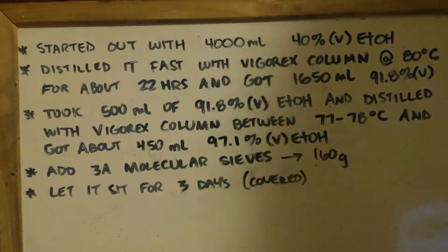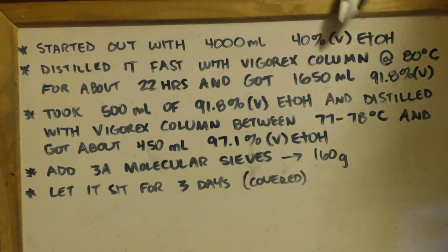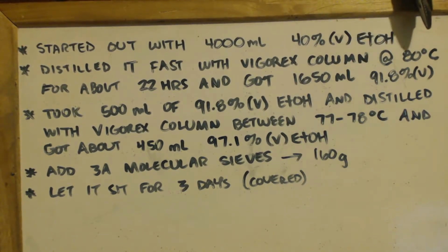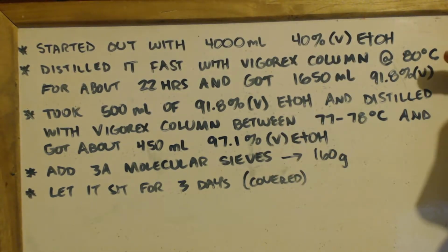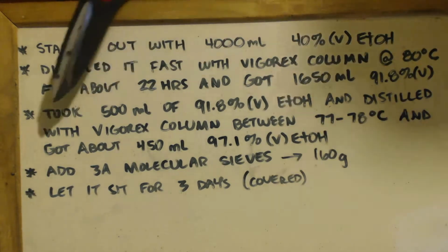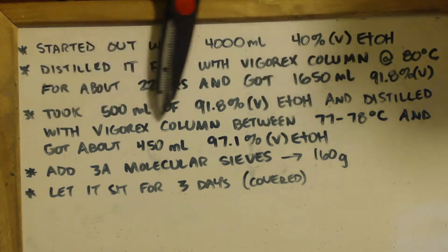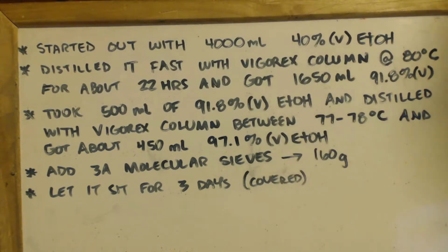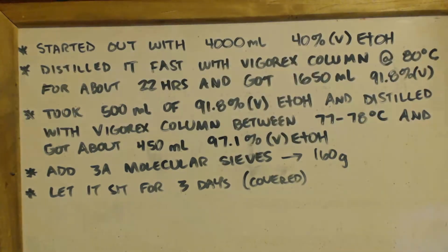Let's recap. Started out with 4,000 milliliters of 40% by volume ethanol, right? I distilled it real fast with a Vigreux column at 80 degrees Celsius for about 22 hours and got 1,650 milliliters of 91.8% by volume ethanol. I took 500 milliliters of that, and I distilled it with a Vigreux column between 77 and 78 degrees. And I got about 450 milliliters of azeotropic ethanol.